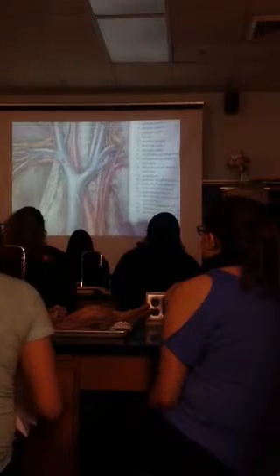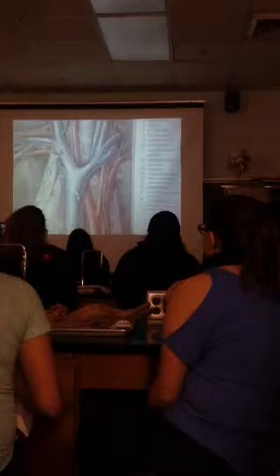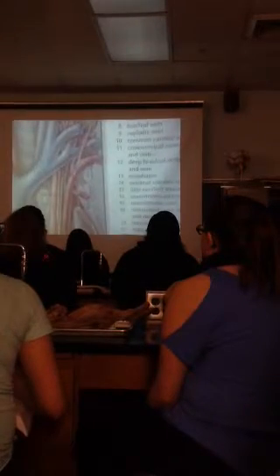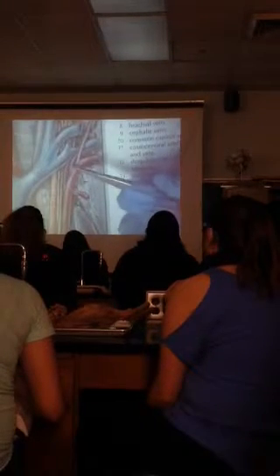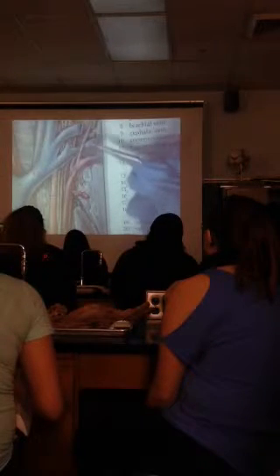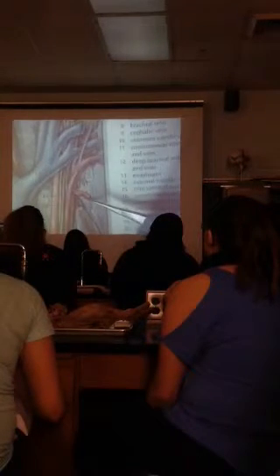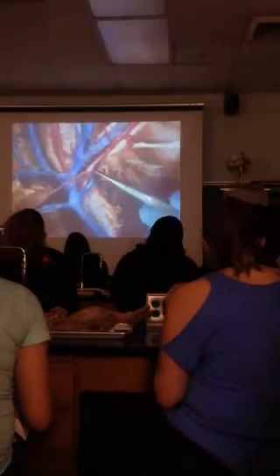Okay, so in this picture is not too hot, but I'll just zoom in so you can kind of see. Off of subclavian, you're going to have this first one here, vertebral. This next one will be what? Costocervical, thyrocervical. Now this one coming down that we looked at, just like this, coming across, is called internal mammary or internal thoracic.